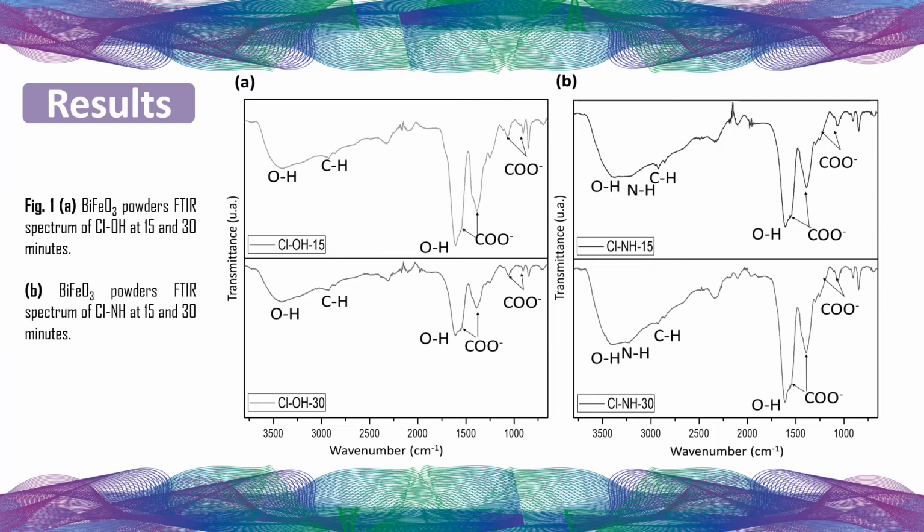In both spectra, a wave is observed in the range of 3700 to 2800, attributed to the stretching vibration of the hydroxyl group.